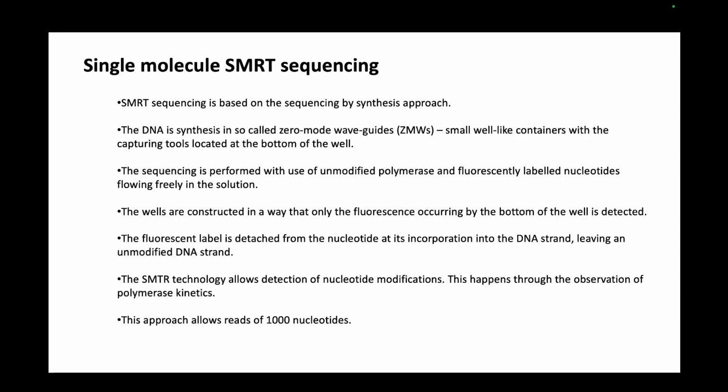So you have a plate like this, you have small wells inside the plate, and at the bottom of the well there is a mechanism by which you can capture whatever it is, be it light, be it radioactivity, whatever you're trying to capture. These small containers are what are known as zero mode waveguides.